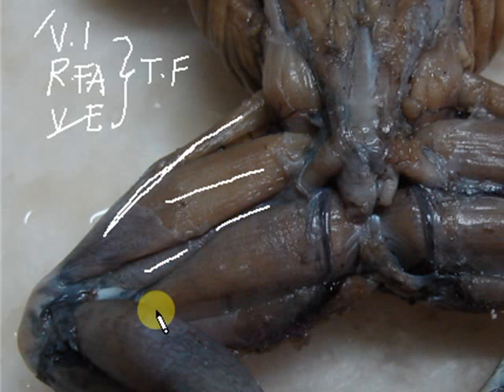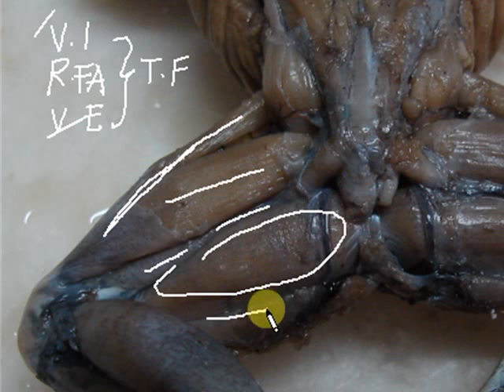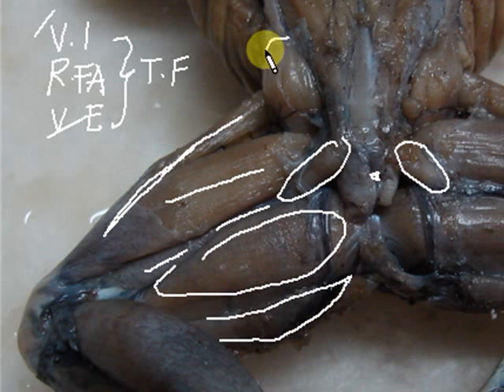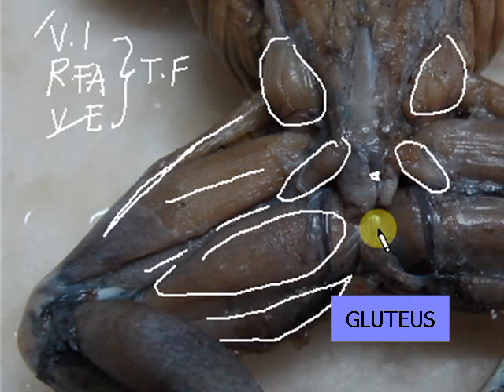Below the vastus externus is the iliofibularis. The big muscle below that is the semi-membranosus. The gracilis minor can be seen both dorsally and ventrally, and it partly covers the gracilis major and semi-membranosus. Also notable are the two piriformis muscles, which are closest to the cloaca, and the two round gluteus muscles — the muscles of the buttocks.